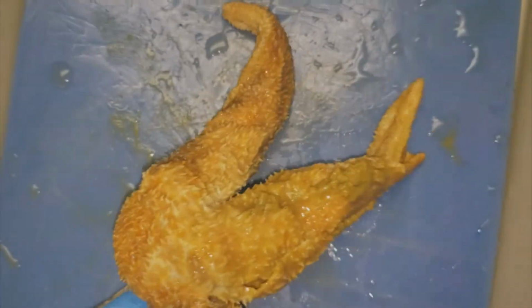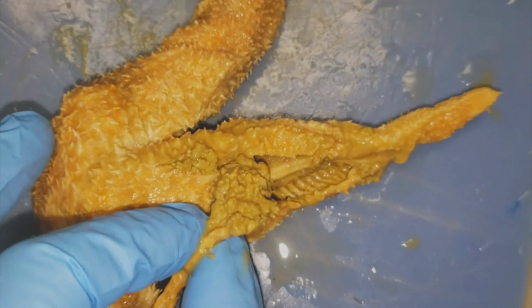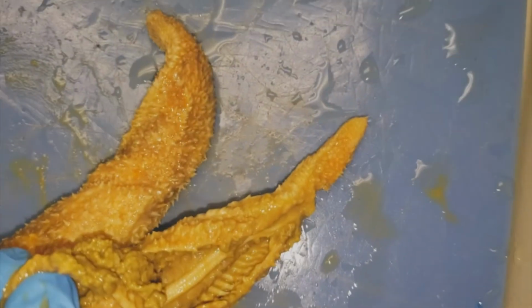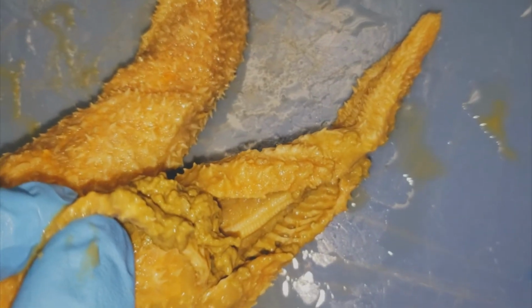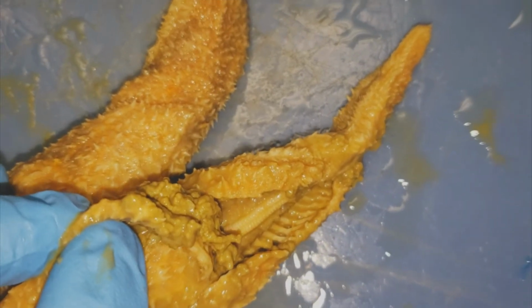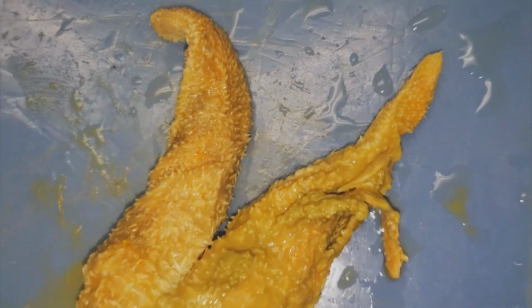We looked at the other side, and we could see digestive glands in here, but not really much on gonads. And you can see the endoskeletal plates pretty well inside, the ambulacral ridge going down the middle. So thank you, starfish, for helping us learn more.